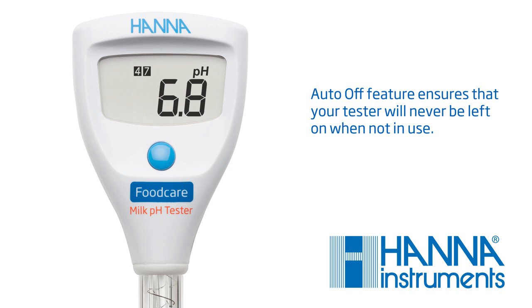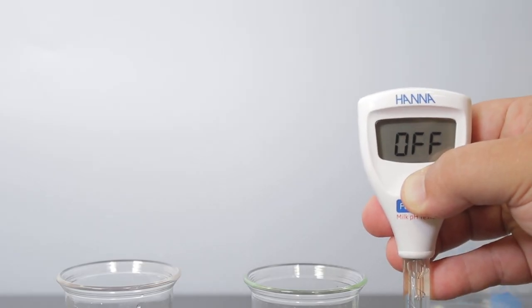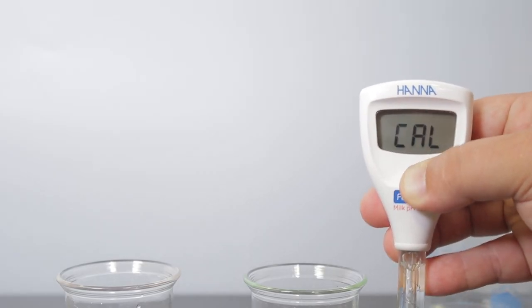You are now ready to begin calibration. Calibration is an important step in ensuring accurate results. We recommend calibrating before each use. To calibrate your tester, press and hold the button for 3 seconds until 'cal' appears on the screen.